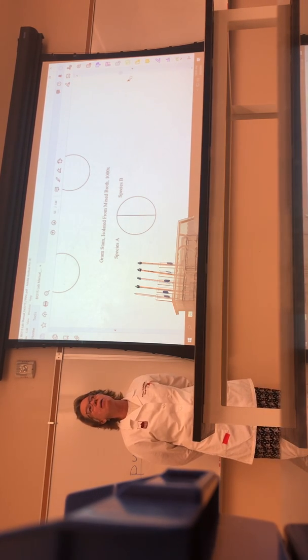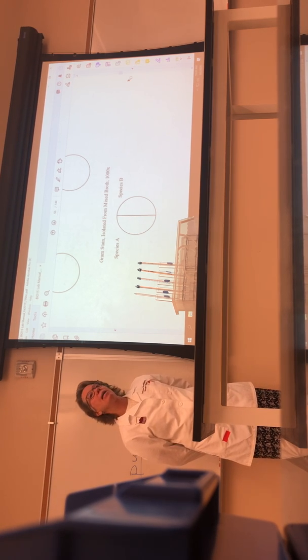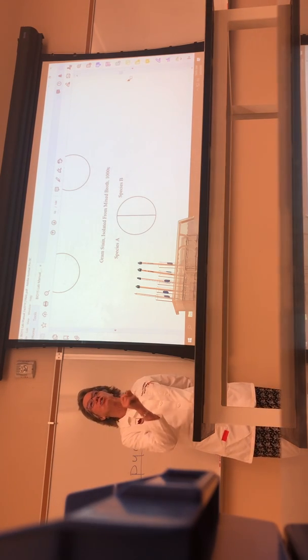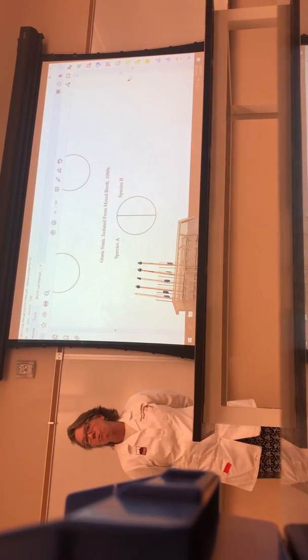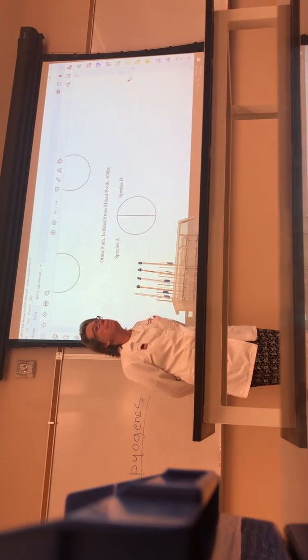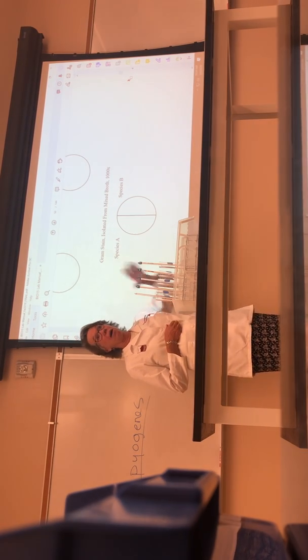Do you guys remember that? Okay. So if it's growing on the slants and it came from the MacConkey, what gram reaction is it? Negative. Negative. Okay? And a few of you had gram positive that grew on a salt. You remember that? There was a few of you. How many of you had that?